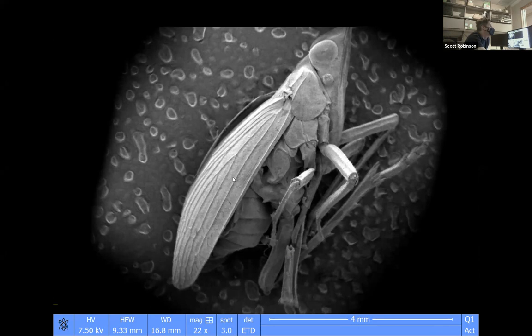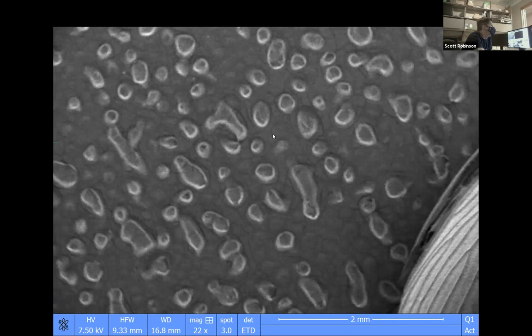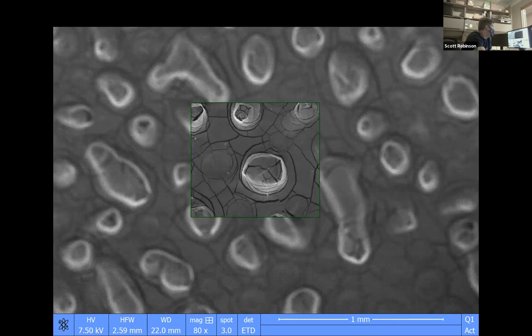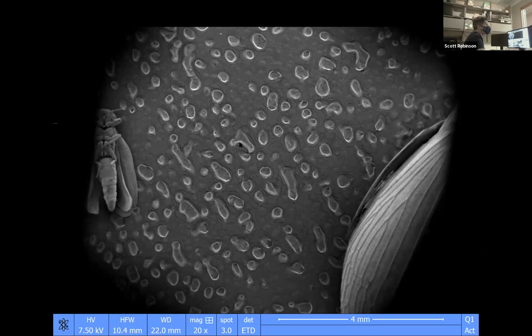So thank you. The background that we see, all these little dots next to this pirate bug right here, is double stick carbon tape, and it has these little craters in it. The carbon tape is what we stick our samples to. So this is the background of everything that we're looking at. Everything is stuck to carbon tape like this. And carbon is conductive, and also it's been coated with gold palladium. The gold palladium is maybe 9 nanometers, and sometimes we make it kind of thick, so 20 nanometers thick.